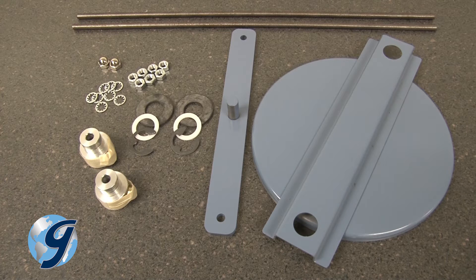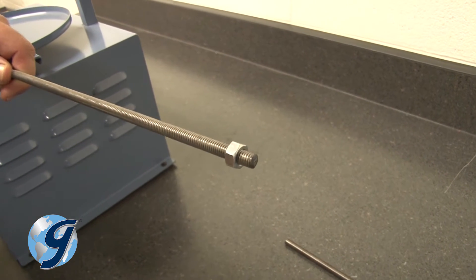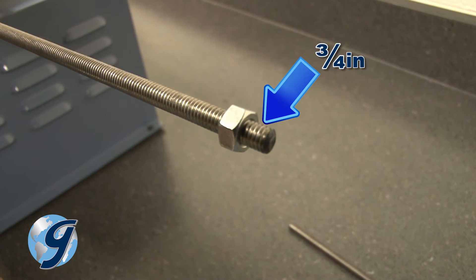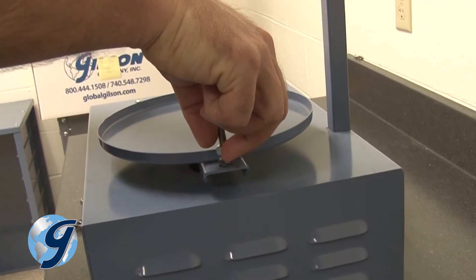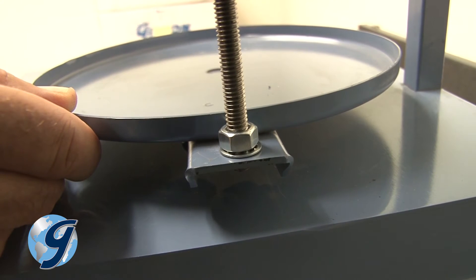Now we're ready to install the newer Easy Clamp upgrade kit. Screw on a new hex nut about 3 quarters of an inch onto the new sieve retaining rod. Next, add a lock washer and insert the sieve retaining rod into the hole on the lower sieve platform.